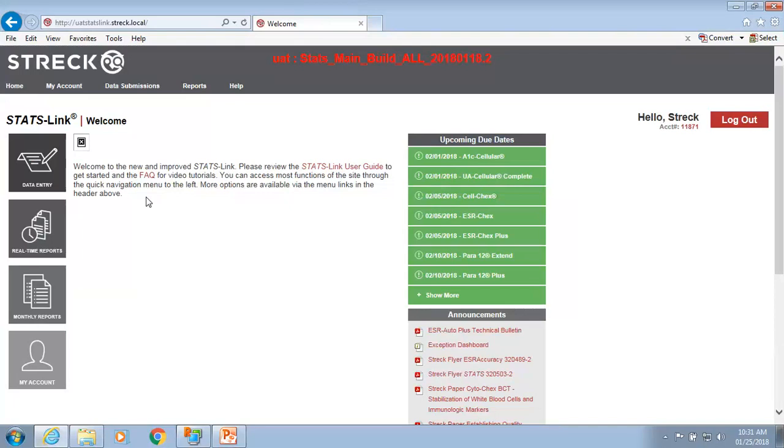They can sign up for that application and be designated as a lab manager, and with proper approvals for those satellite clinics, they can receive a special report that brings all of that data for the satellites together. I just wanted to mention that's another option available in the application if that is something that may be interesting to you.